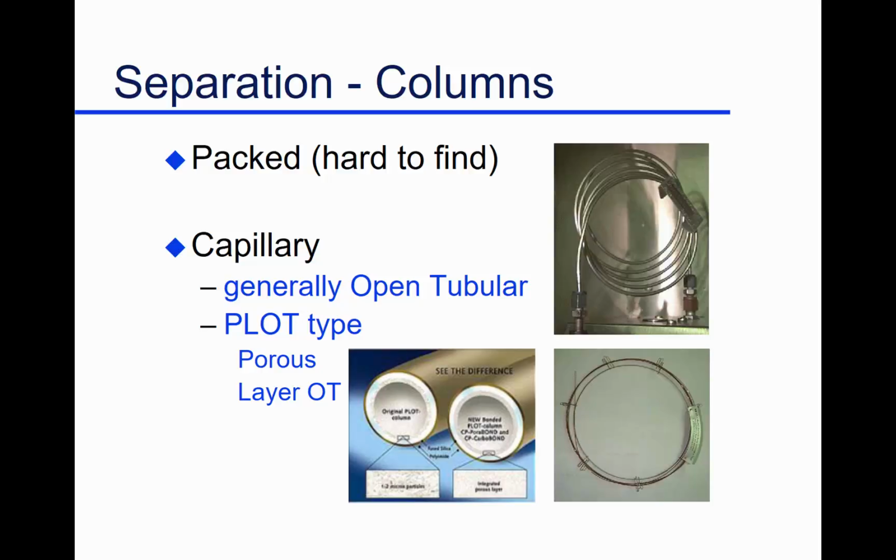And that, we coil up here. Inside of that is a granular material, our stationary phase. So there's a granular material that's coated with material that's going to be partitioning. It's going to go between that coating on this granular material and your mobile phase. So long gone, you'll have trouble finding them, which is good.